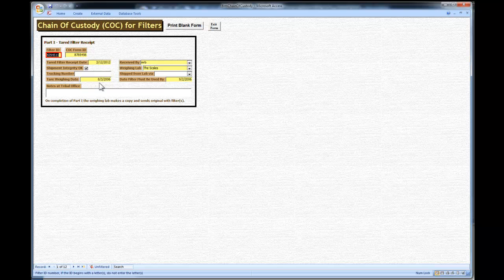And that's important to validate your data because PM 2.5 is so volatile that you really need to reweigh the filter if it hasn't been exposed, because the filter can actually change in terms of the amount of moisture it takes up, etc. So there's a lot of requirements for PM 2.5 filters.